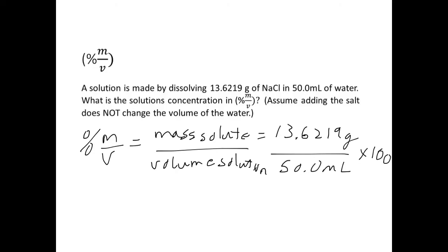I punch that into my calculator, and that gives me 27.2438% as the mathematical number.